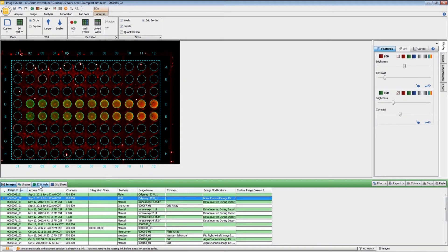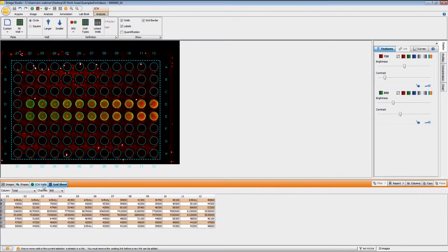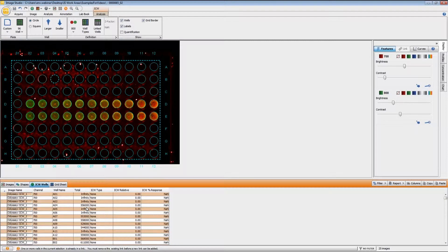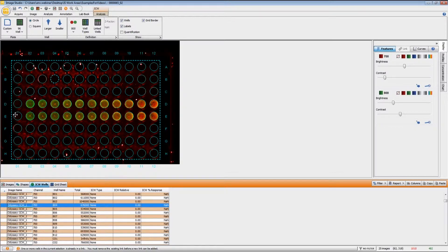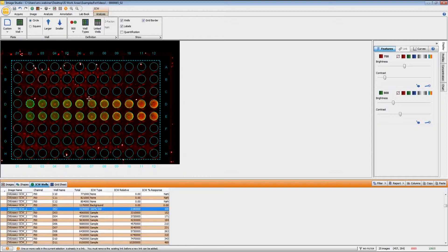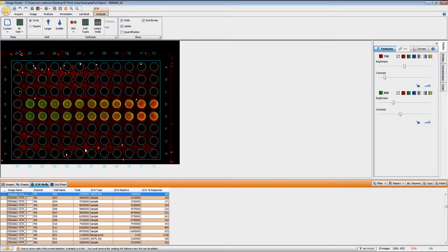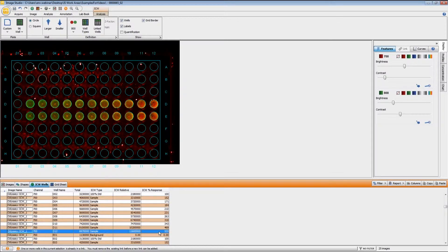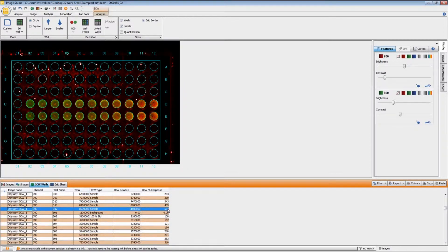We now have two new tables: the InCel Western Wells table and the Grid Sheet. For the Wells table, this is a listing of all of the wells giving you the total and also the relative value. The relative is a combination of calculations — it uses the background wells for background subtraction and calculates based on the normalization channel, so if you have cell count differences, it will account for that. The InCel Western percent response is based on those two wells I designated as 100%, and as we see increasing phosphorylation across the plate, the last well shows phosphorylation has increased 533%.